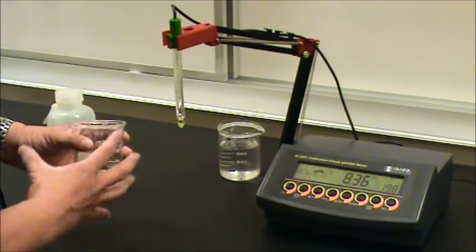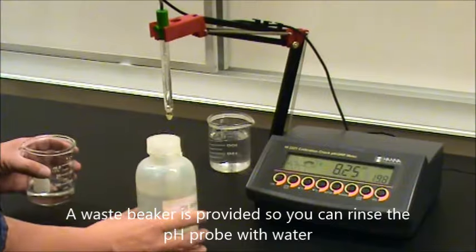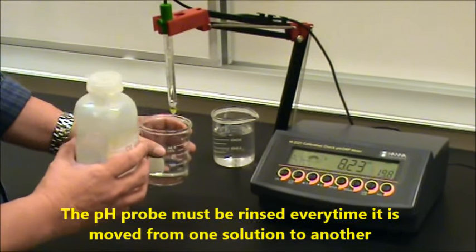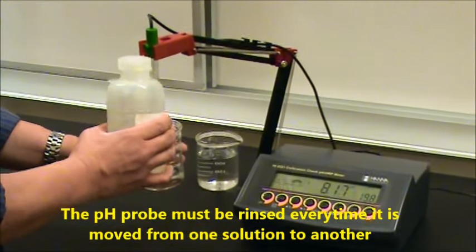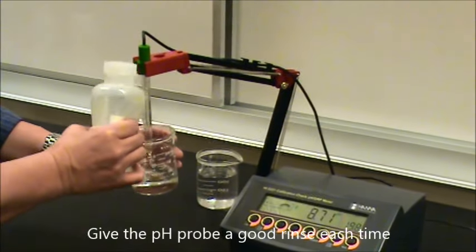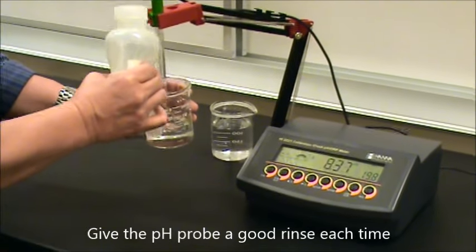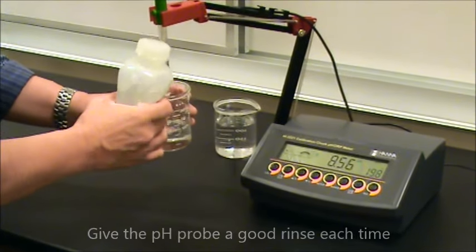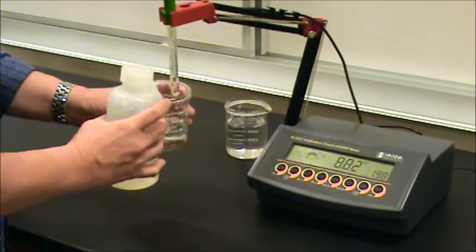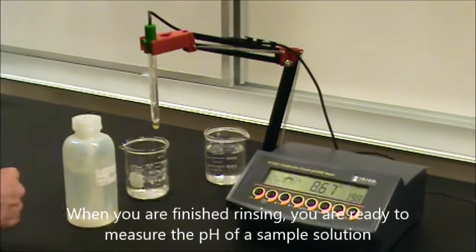You'll also have a larger waste beaker for holding the rinse solution. Before you put the tip into any other solution for measurement, you want to make sure that you rinse the tip of the probe off. Give it a good rinse. If you're not quite sure, overdoing it is better than underdoing it. Make sure the probe is nice and clean with a rinse before you use it for measurement.